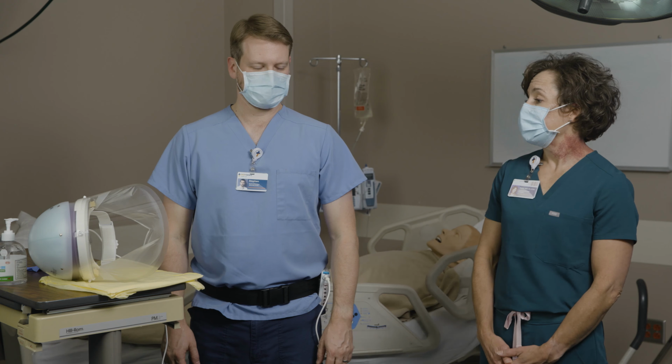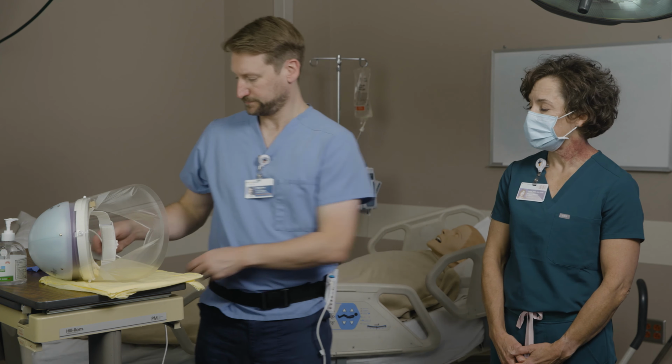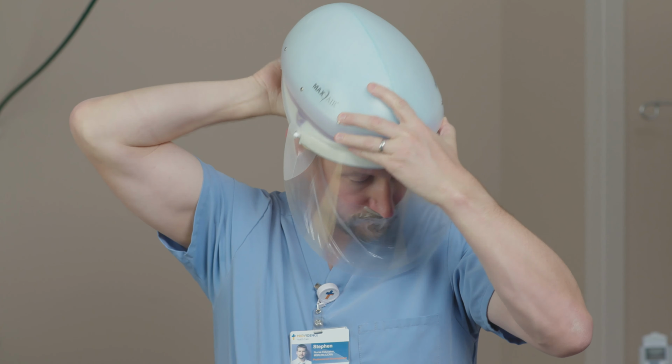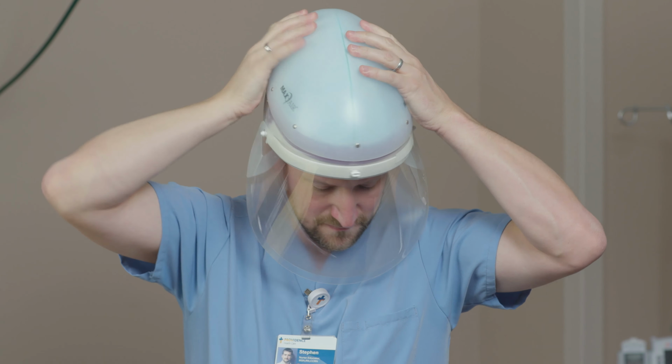Next, Stephen is going to don the CAPR. First, he's going to doff his face mask. Then he's going to grab that CAPR by the knob, loosen it, and then put it on his head and adjust to get a good snug fit. And then he'll extend that film underneath his chin.